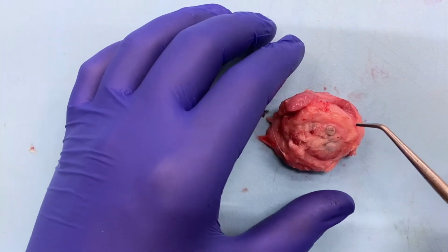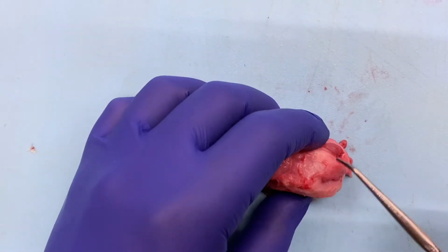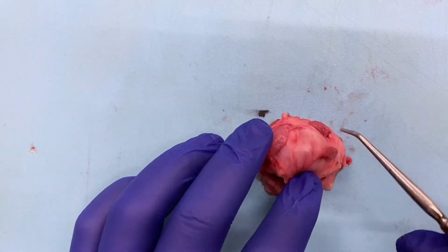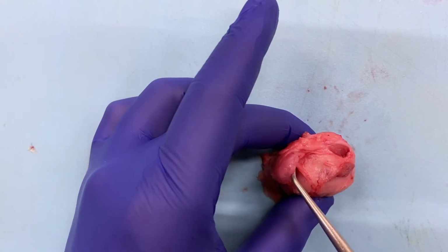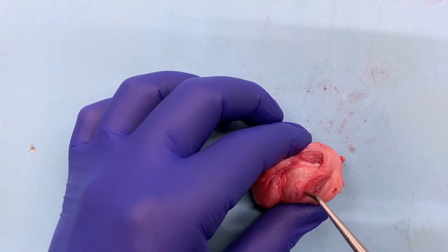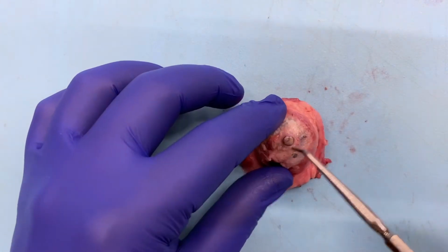If we turn the eye and look posteriorly, we can start to see our orbit muscles coming off. And these can be used for orientation if you get an orbit resection, but usually for an enucleation specimen, as we'll see when we get a little bit closer, a lot of these musculatures will not be attached or visible clearly. But knowing that this is going to be our superior aspect with our lacrimal gland, we know that we have our superior rectus muscle here, our superior oblique, you can kind of see heading over. We have our inferior rectus, our lateral rectus, and our medial rectus right here. So those can be helpful for orientation.